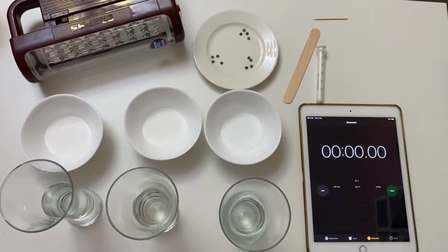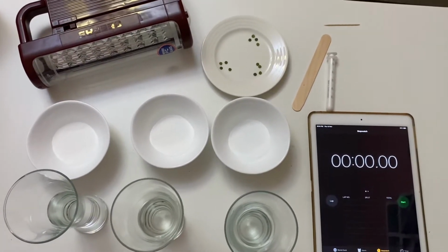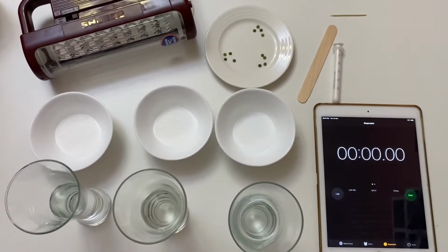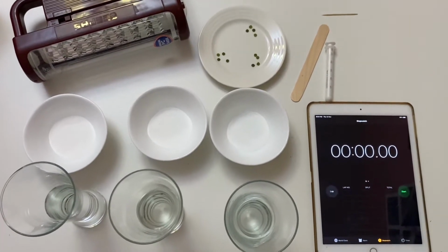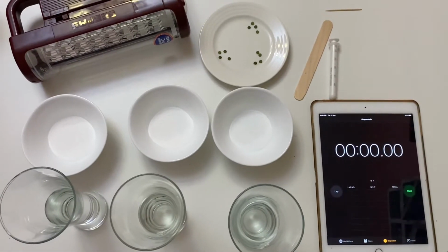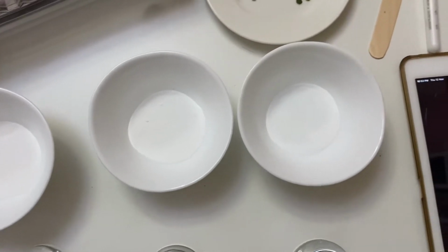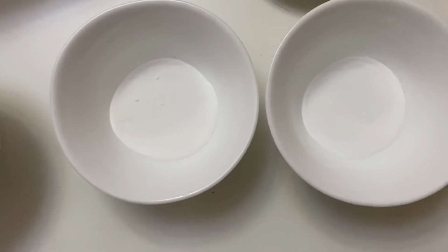Now, in this experiment, we're going to need a light source, discs of organic spinach, which is 4 discs for each container. They have to be equal. Sticks, they can be of any type, a syringe, a stopwatch, 3 glasses with the same amount of water, which is 100 milliliters, and here we have the different amounts of bicarbonate of soda. Here it's 1 tablespoon, in the middle it's 2 tablespoons, and 3 tablespoons. And now we're going to start our experiment.